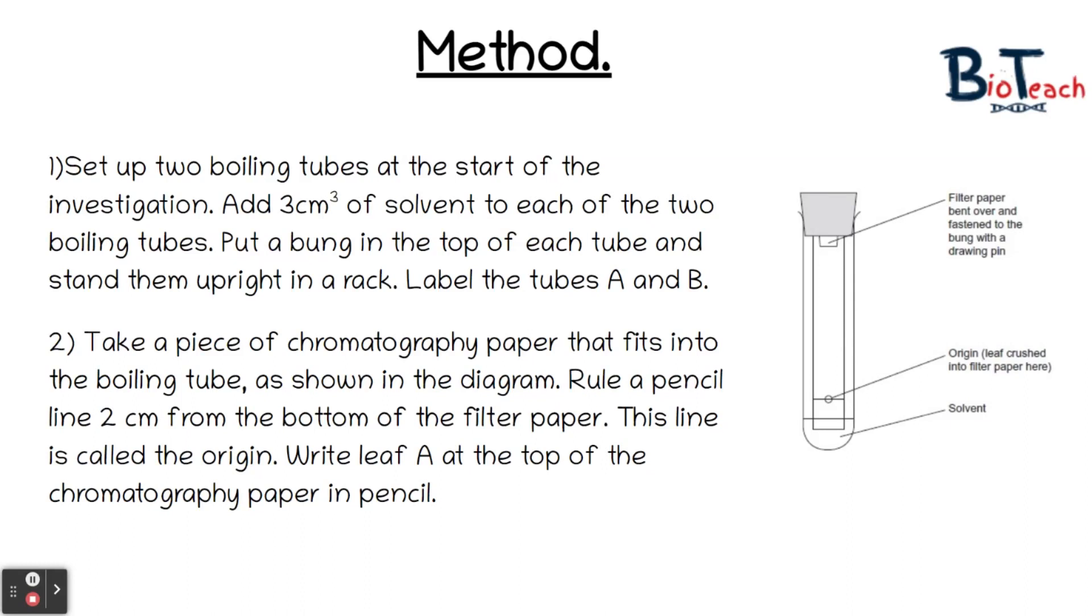You'll be given a set of boiling tubes and at the beginning you need to set up those two boiling tubes and add about three centimetres cubed of solvent to each. Put a bung in the top of each tube and stand them upright in the rack. These solvents are going to evaporate off if you don't put the bung in, so it's really important to measure it and pop the bung in as soon as you have put the solvent in. Make sure that the tubes are labelled A and B because they're going to be for your two different leaves.